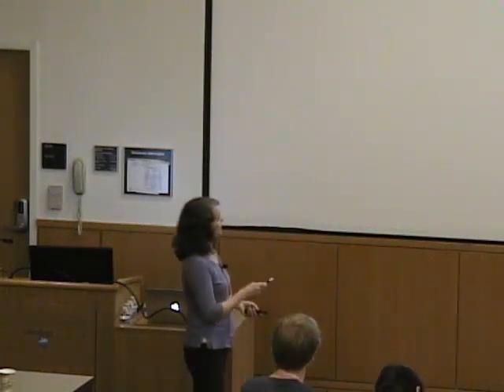Okay? So it would not be advisable to measure line broadening in a small molecule and use that line broadening as a way to measure distances, because you're going to have a combination of contact and dipolar mechanisms for that line broadening. Okay? So that paramagnetic relaxation enhancement will really only work for a large molecule. But you can get contact relaxation in other cases.